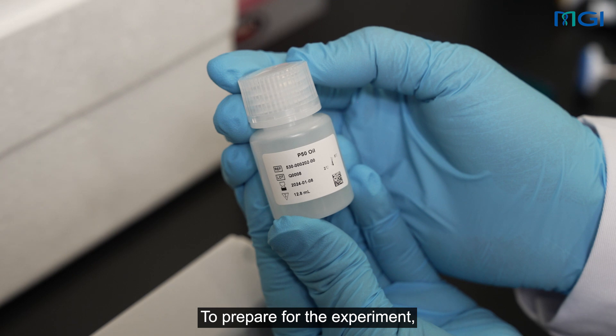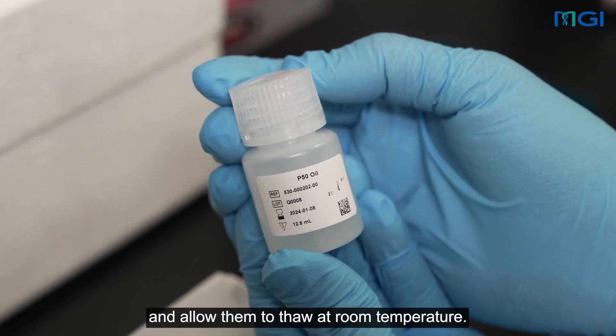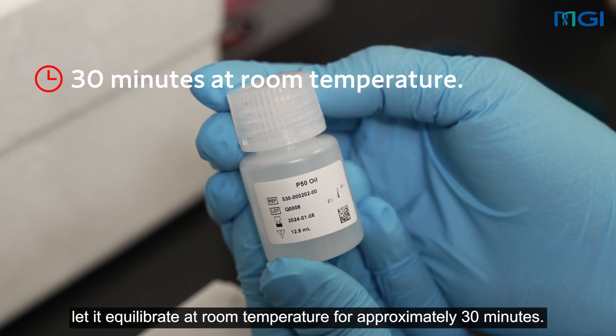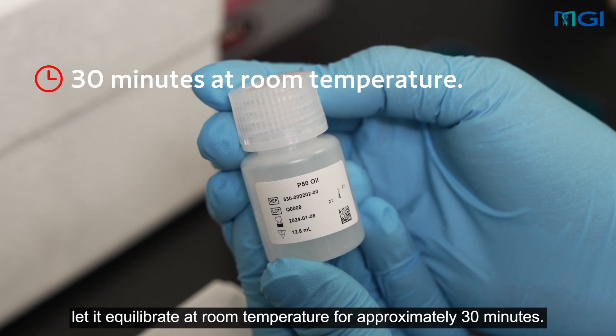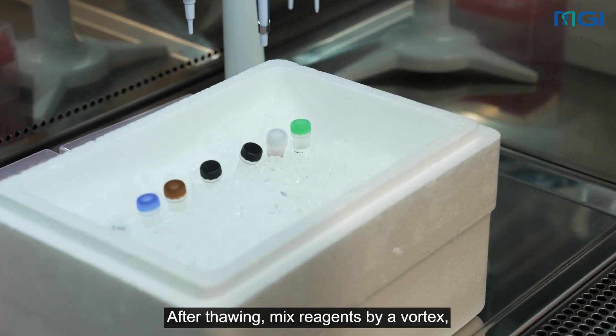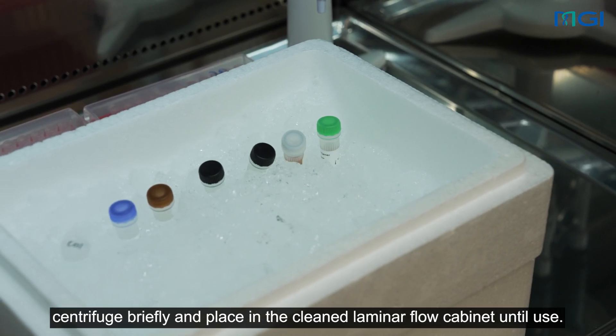To prepare for the experiment, retrieve the required reagents and allow them to thaw at room temperature. Make sure to take out the P50 oil ahead of time and let it equilibrate at room temperature for approximately 30 minutes. After thawing, mix reagents by vortex, centrifuge briefly and place in the clean laminar flow cabinet until use.